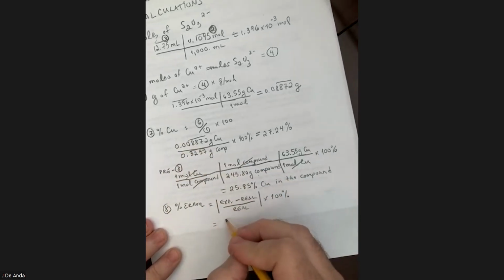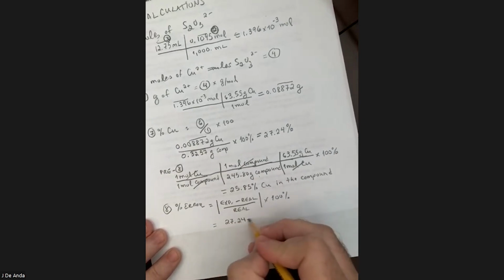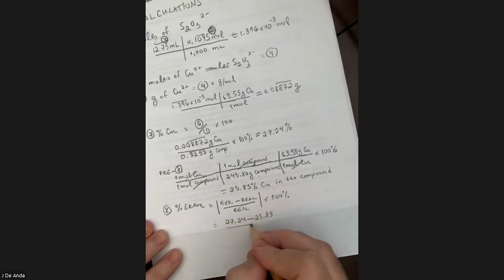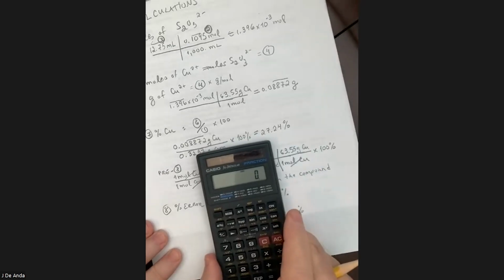So that's going to be 27.24 minus the real value, 25.85, divided by the real value, 25.85. And just to avoid negatives, we're going to take the absolute value of that times 100%.